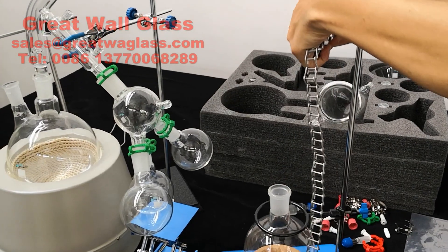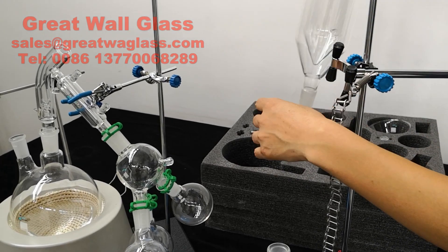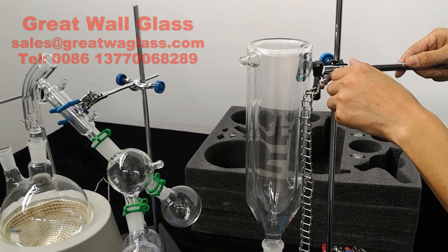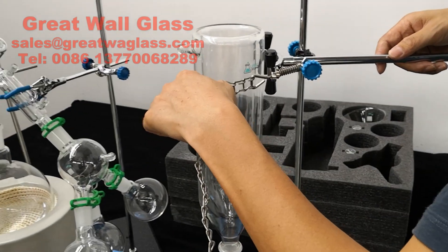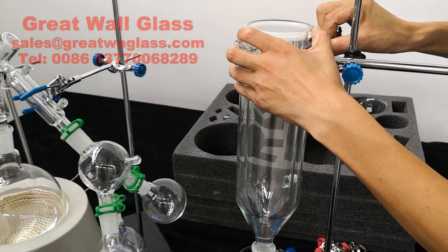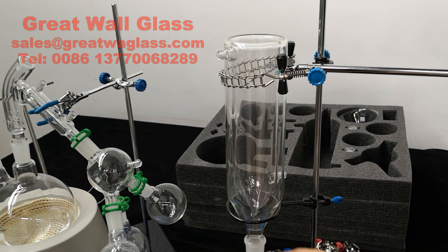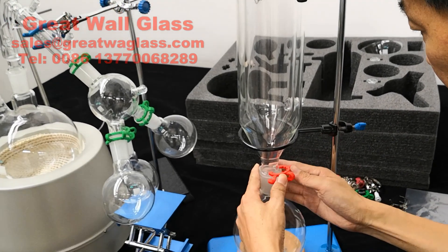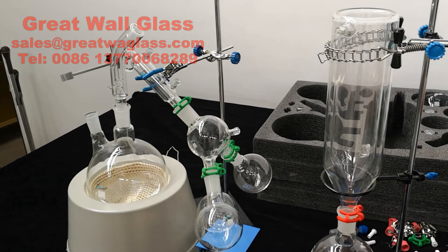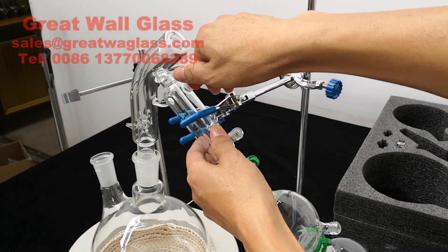And the chain clamp, which are used to hold the cold trap — the two liter cold trap. Then you put the plastic clamp on and you put the nozzle on.